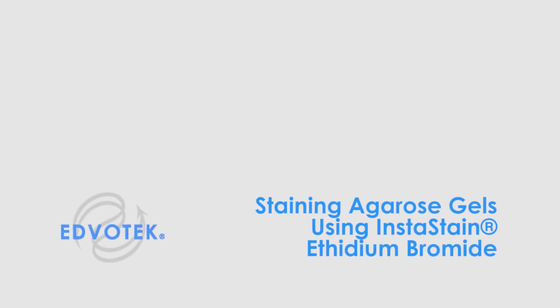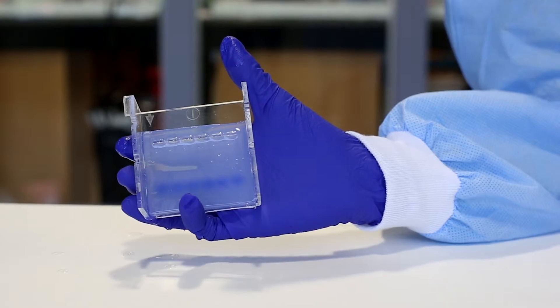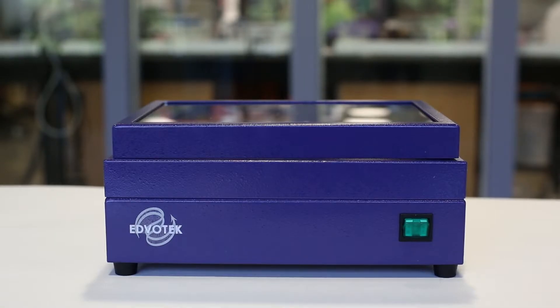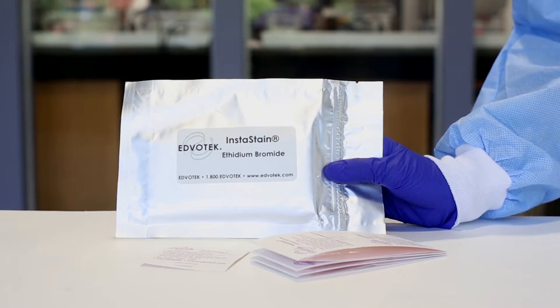Edvotek instructional video: staining agarose gels using instastain ethidium bromide. For this experiment you will need an agarose gel, electrophoresis buffer, an ultraviolet transilluminator, and instastain ethidium bromide. Always wear gloves and goggles when performing this experiment.